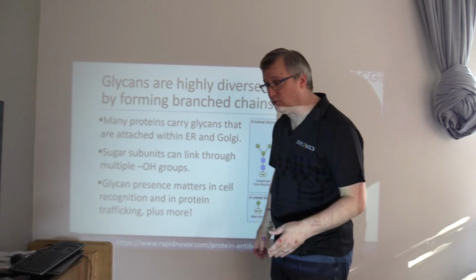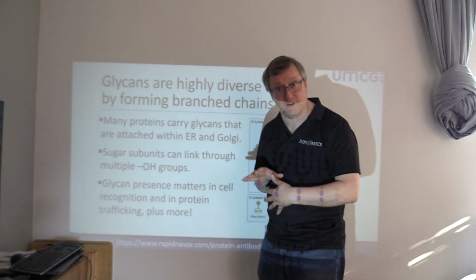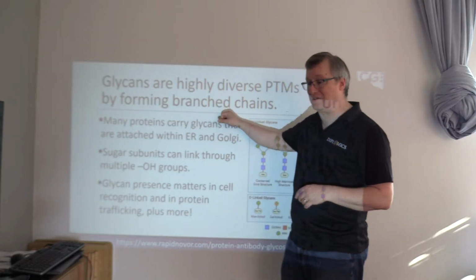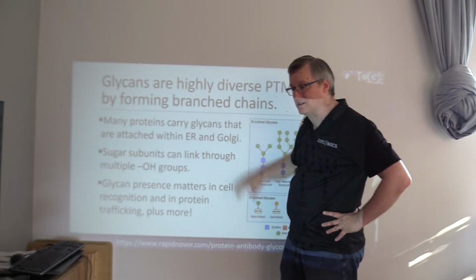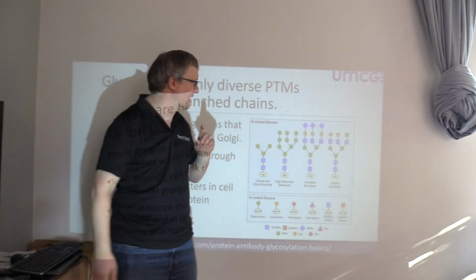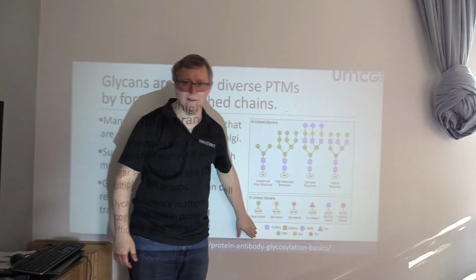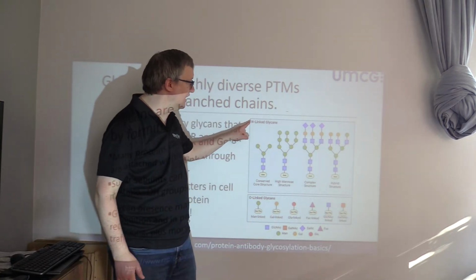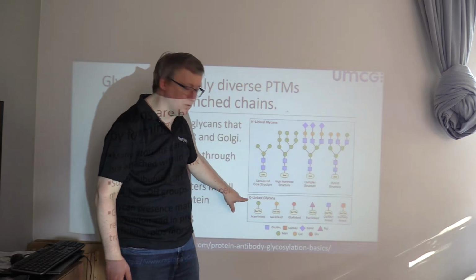Antibodies are not the only proteins that can be used for affinity enrichment of modified peptides. And for that, we should really talk about glycans. So glycans are a really special case for post-translational modifications. I'll try to talk through this. First off, of course, we have a variety of sugars that can be attached to proteins. They may be attached in an N-linked way, or they may be attached in an O-linked way.